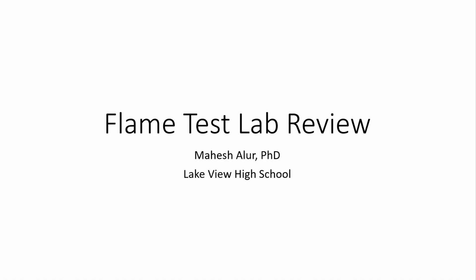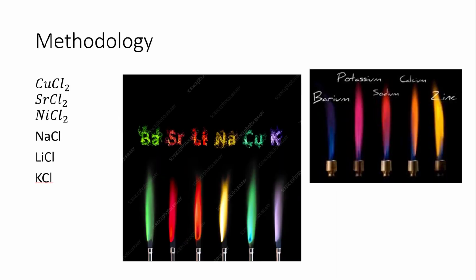Hi everybody. In this video, I'm going to review with you the flame test lab that we did a few weeks ago. So what you did was you took these different chloride compounds, and you put a stick that was in water, and you touched it to the compound, and you put it in the flame, and it made all these pretty colors, right? And you say ooh and ah, but what does it actually mean?